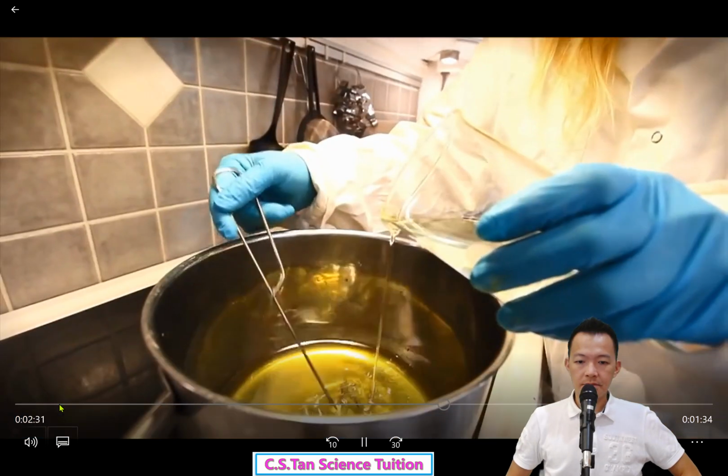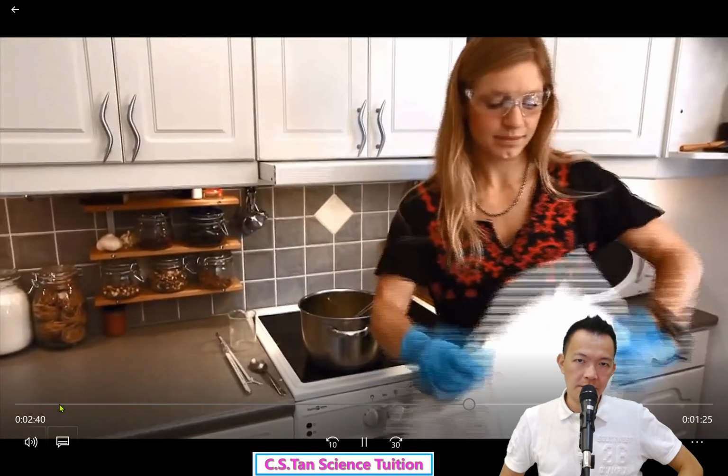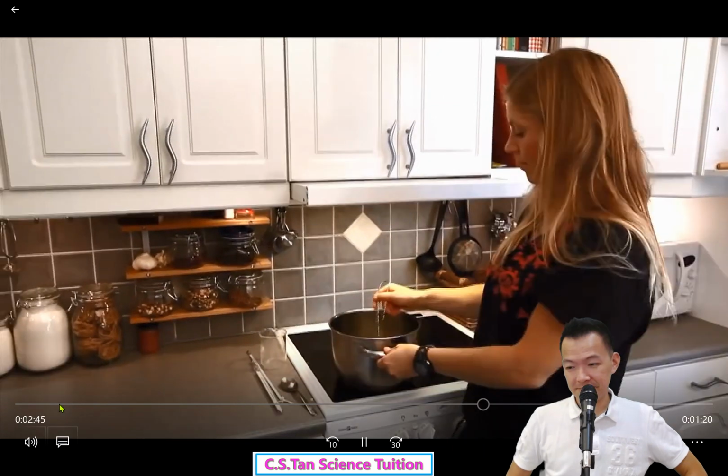We slowly pour the sodium hydroxide solution into the mixture of fats while continuously stirring. With your teacher's approval, now when the sodium hydroxide solution is not as concentrated anymore, it's okay to work without protection gear as long as you're careful.